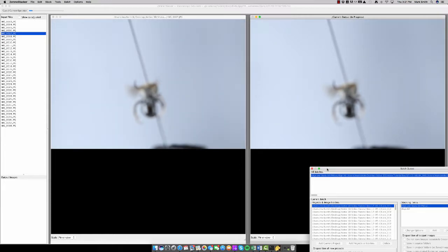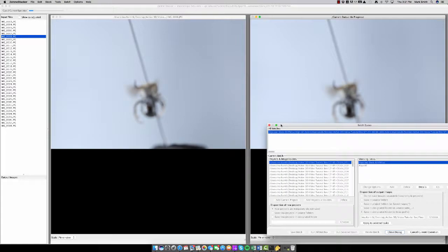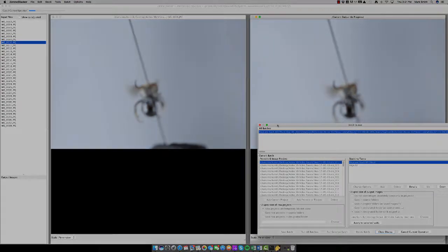And that is all there is to the third tutorial video. So we're going to let this run, and in the next tutorial video we're going to take all the final images, and then I'm going to start to produce the 3D model using Agisoft Photoscan. I'm going to walk you through that workflow.